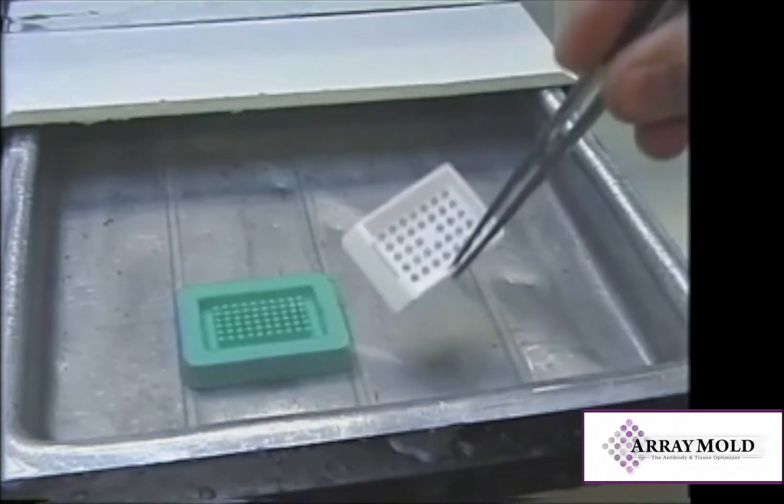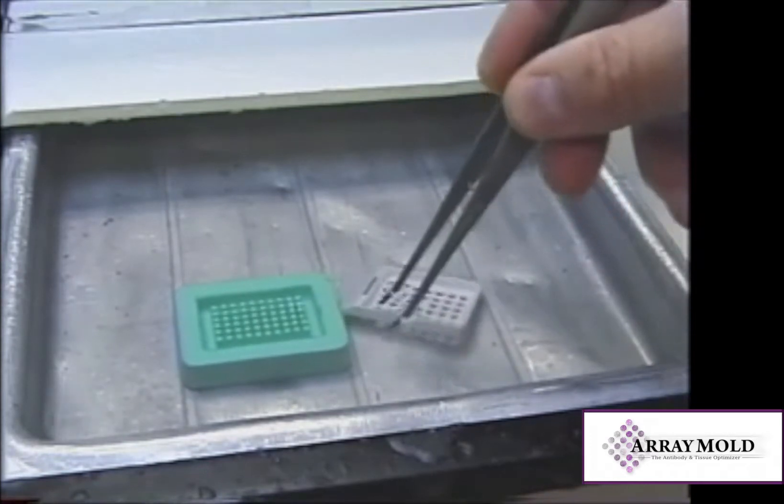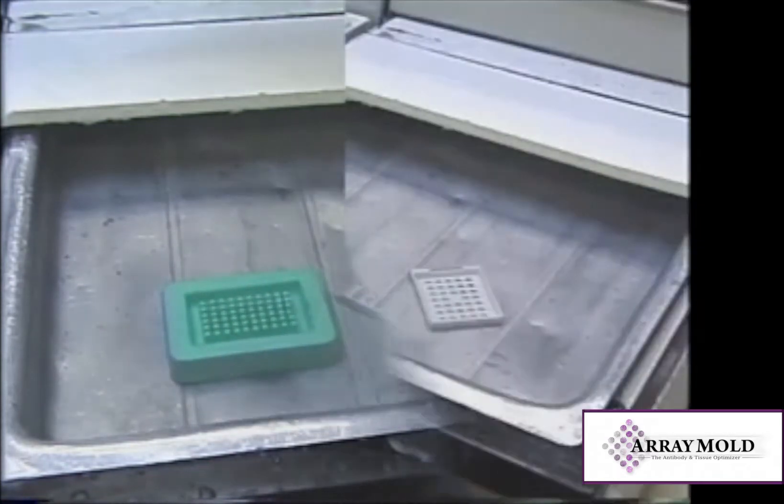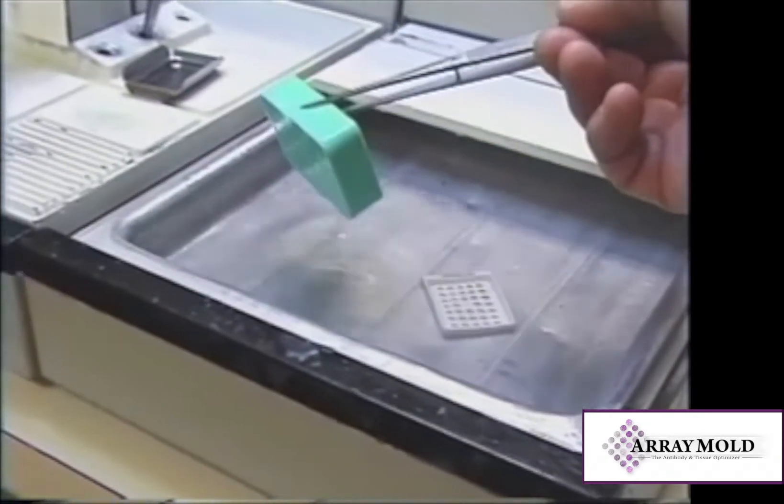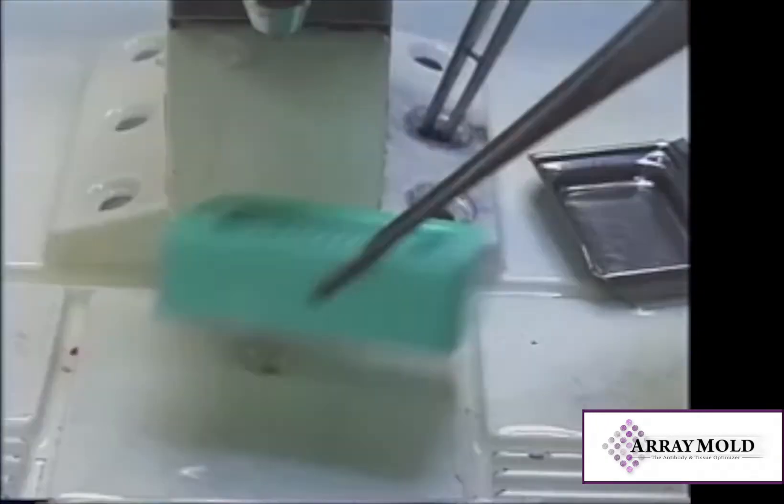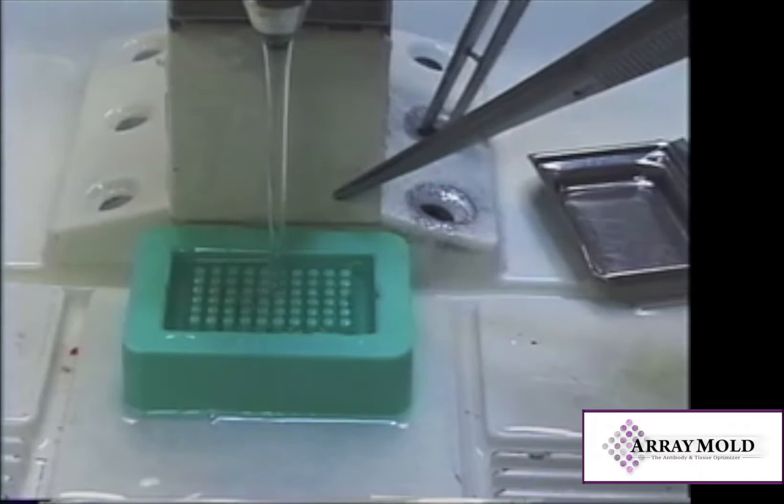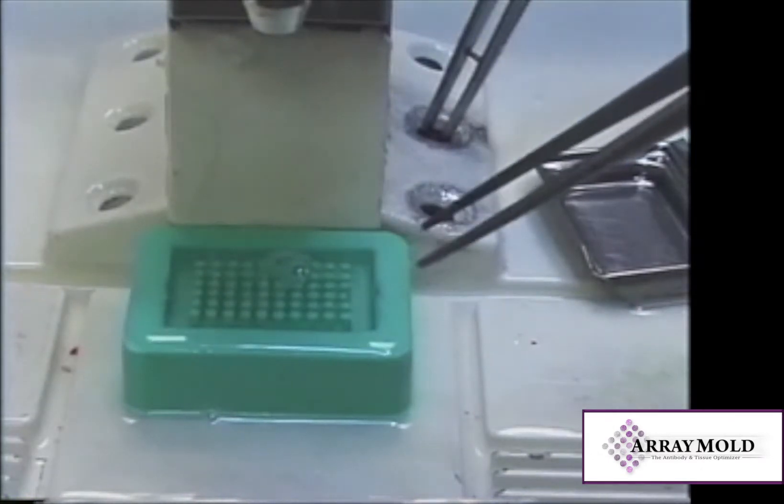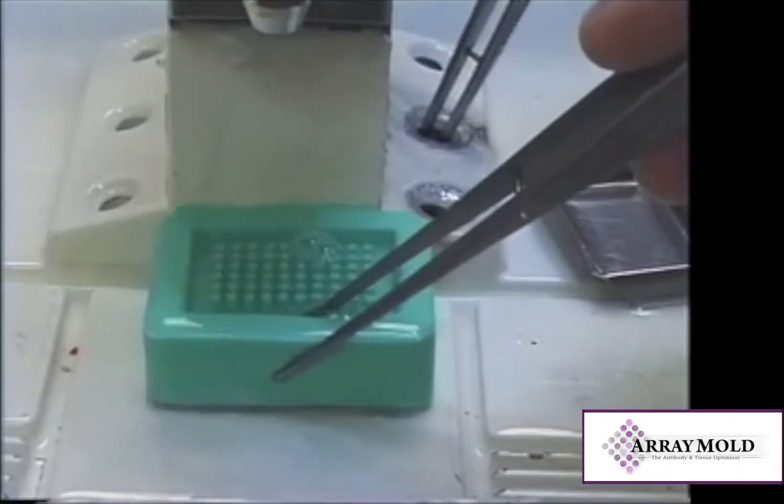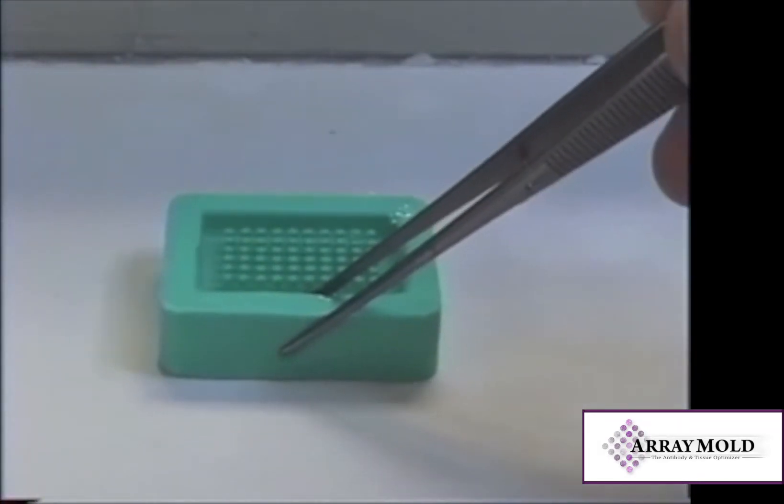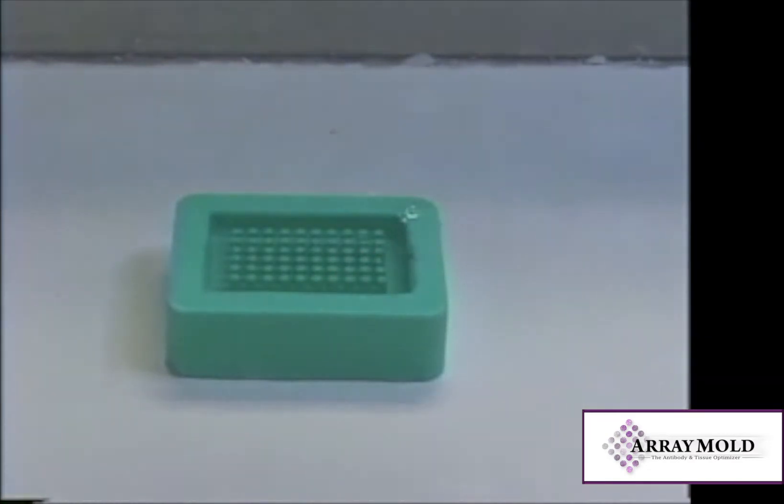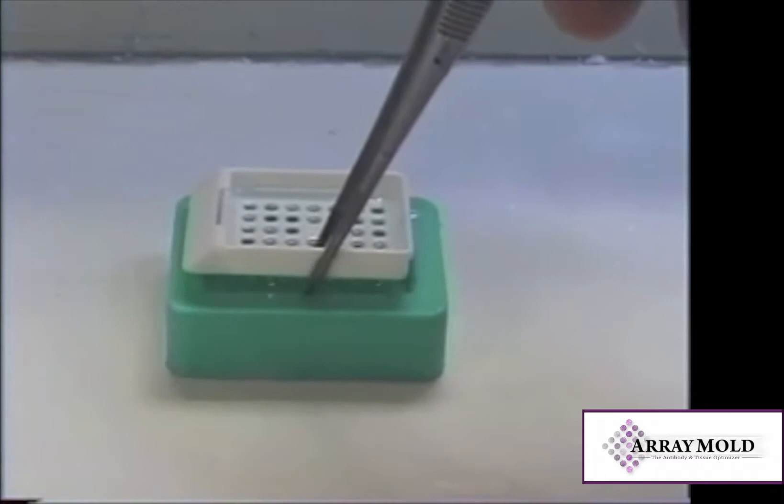Submerge the plastic cassette in paraffin as well. Fill the mold with embedding type paraffin. Place the mold on a cold plate and set the plastic cassette in the center of the array mold and allow to cool for approximately one hour.